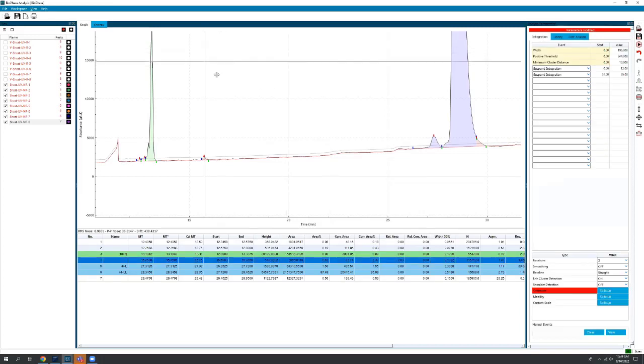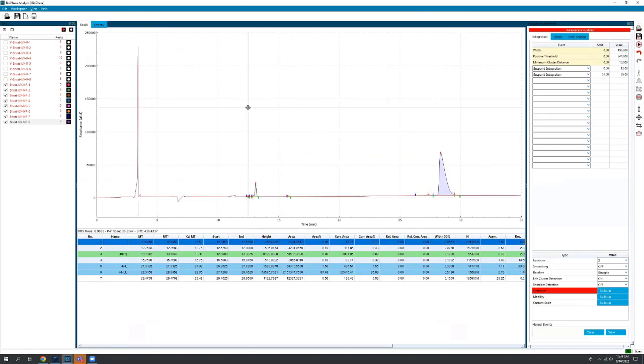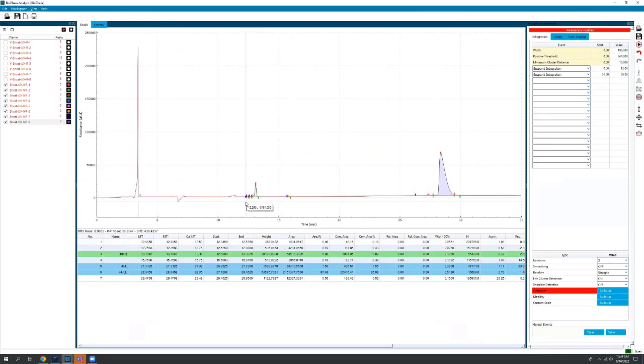So there are a lot of unique features in this software that I've grown to like. I do a lot of my data processing by importing it into this software because it is very user-friendly.